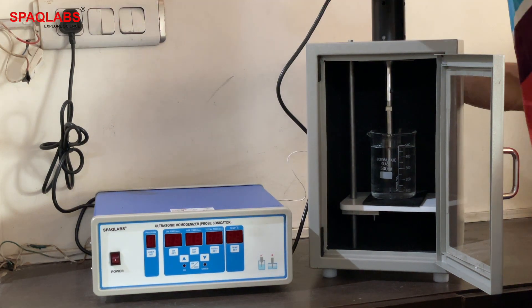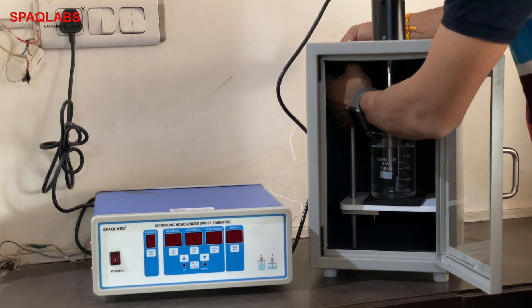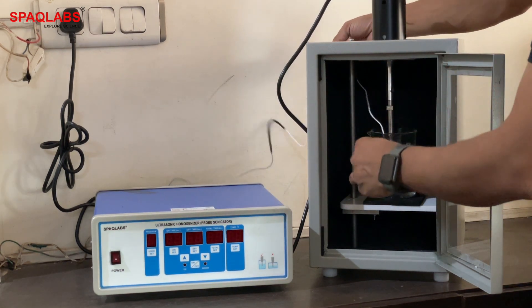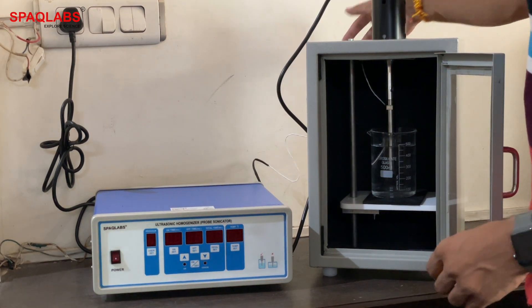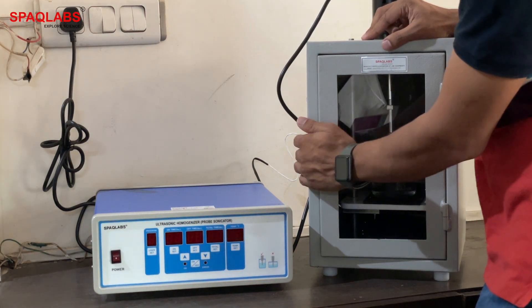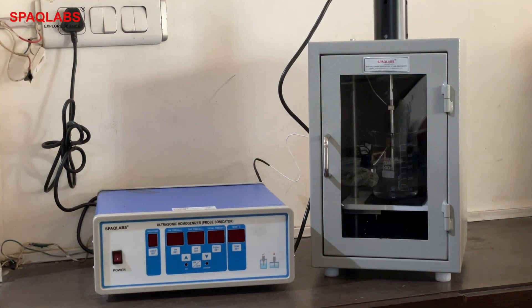We will insert the temperature probe from the back of the sonicator and dip it into the sample. Then we will close the soundproof box. Now we will see how to use it and how to program it.